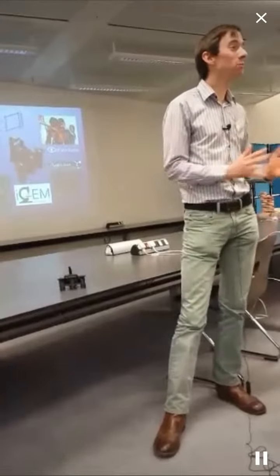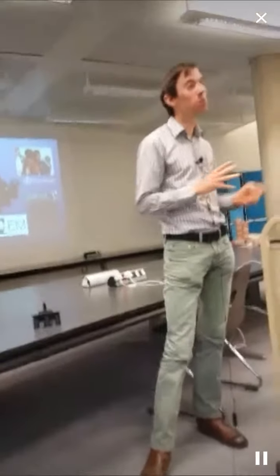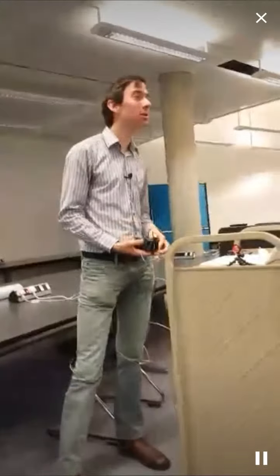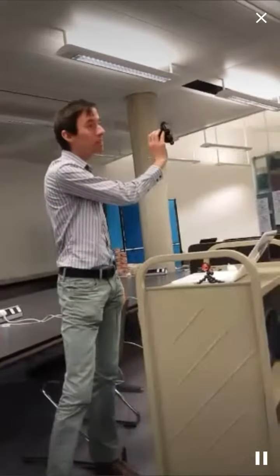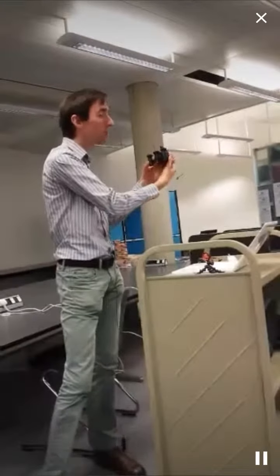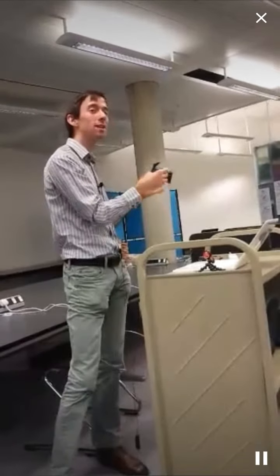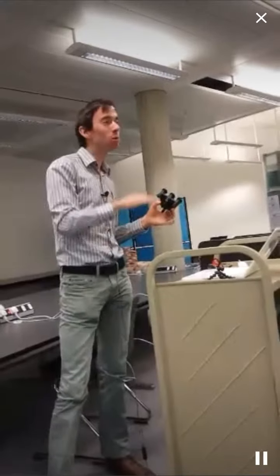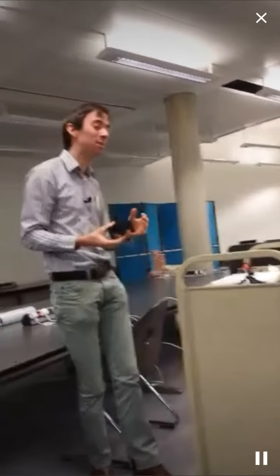3D printers are great — they're really fun. I know a lot of people with a 3D printer in their lab. How do we use them to produce really useful objects? The reason I was asked to give a talk is this: it's a completely 3D printed microscope, complete with micron-level translation stage. It's got a three-axis flexure stage, because actually a microscope is mostly a mechanical device — if you can't hold something stably, you can't image it.